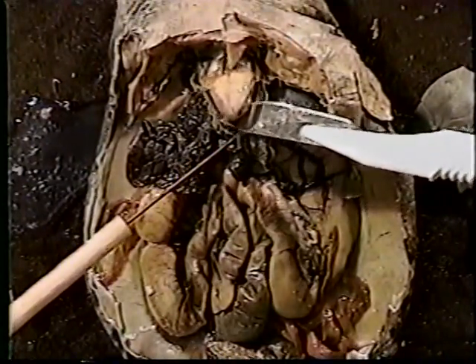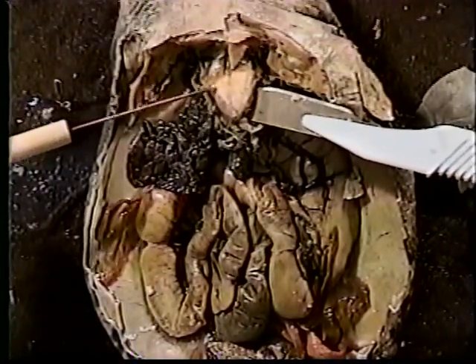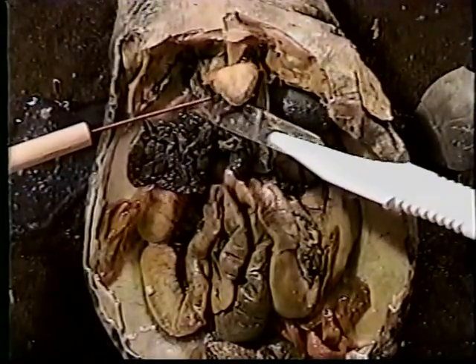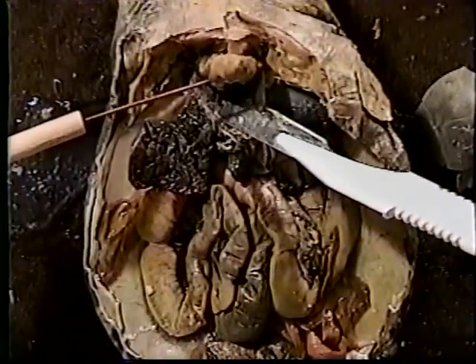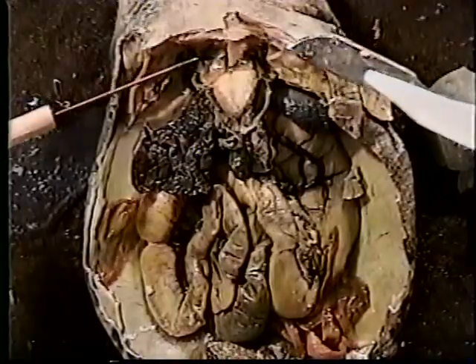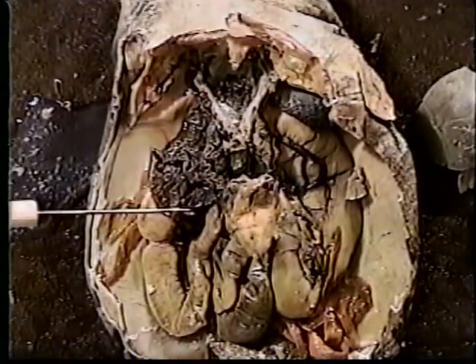Now we want to more closely examine the part of the circulatory system that we set out to isolate, the heart. This will be best examined if we can cut it away from the other organs in which it is situated. By getting underneath, this task is much easier. When examining the heart, we need to keep in mind three primary areas: the right auricle, the left auricle, and the ventricle.